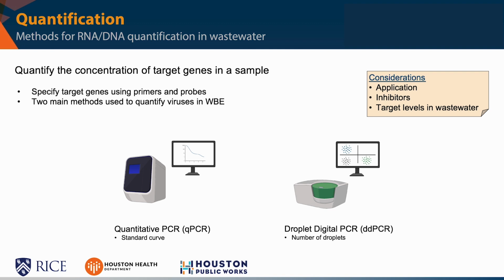in the sample. Now that we've reviewed the basic steps involved in quantifying microbial targets in wastewater for wastewater-based epidemiology and methods that can be implemented for each step, I'm going to play a short video that reviews the methods used in the Houston system to quantify SARS-CoV-2 in wastewater.